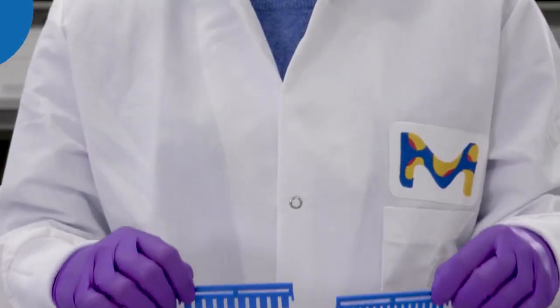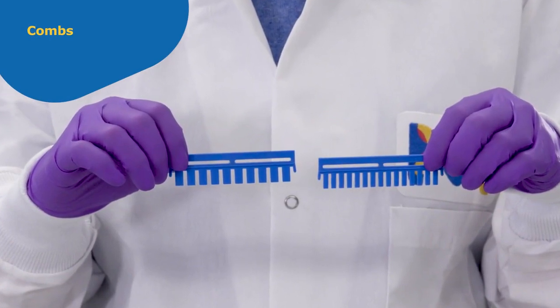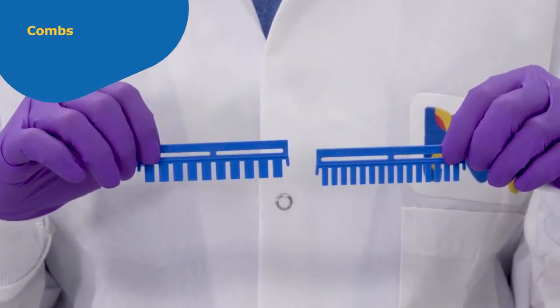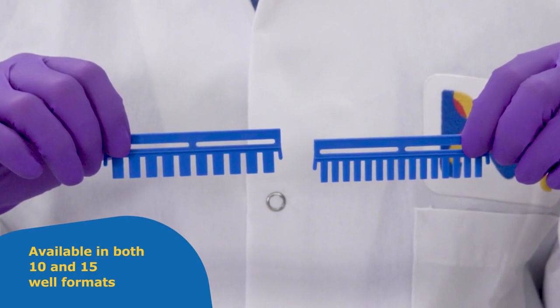The combs are used to create wells within the gel. Combs are available in 0.75, 1.0, and 1.5 millimeter thicknesses in both 10 and 15 well formats.